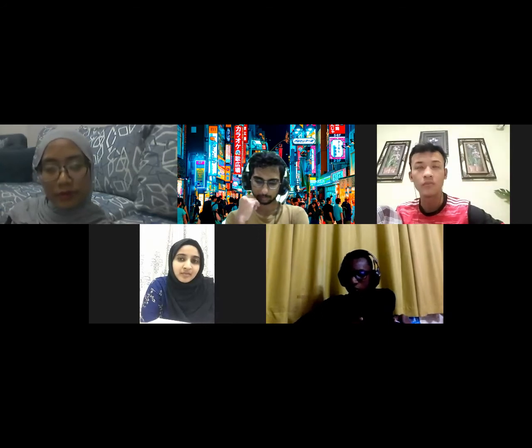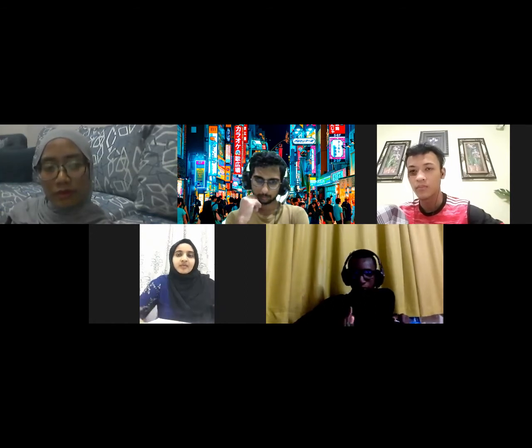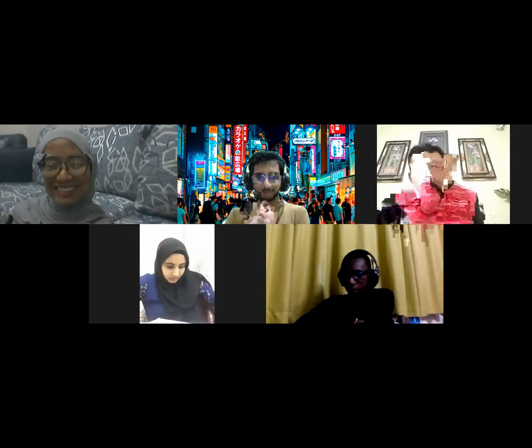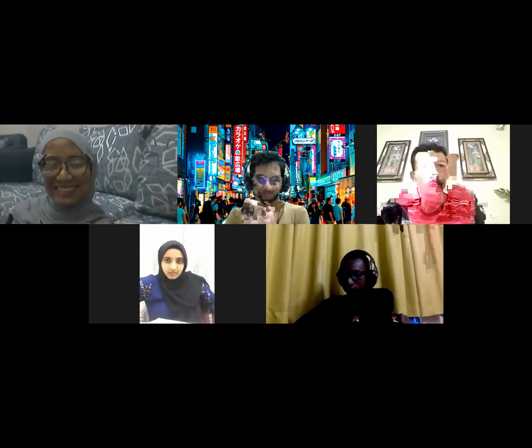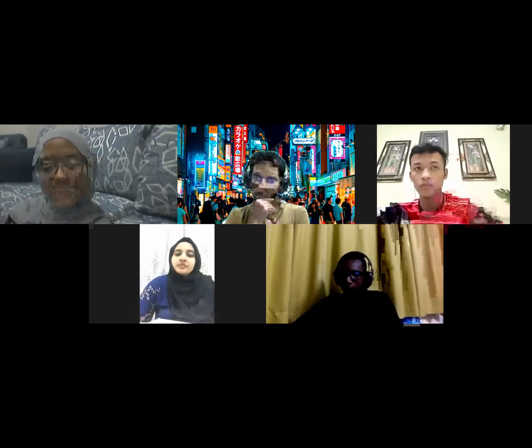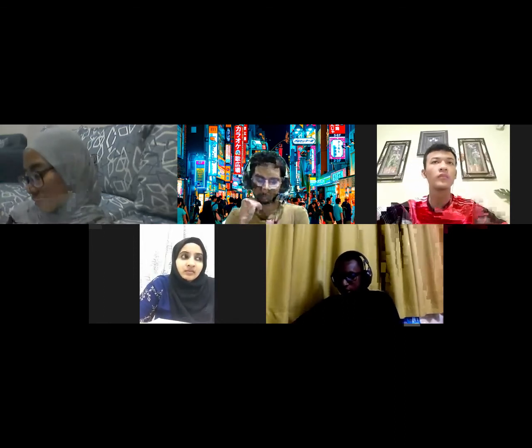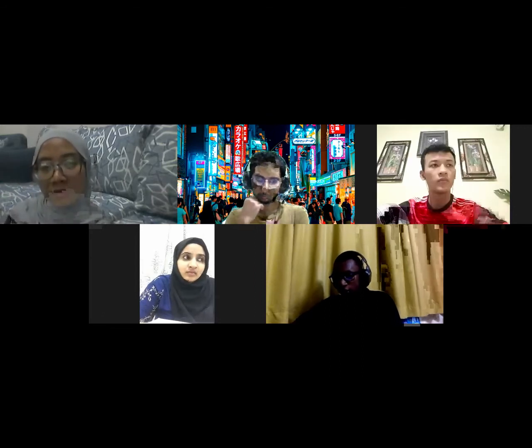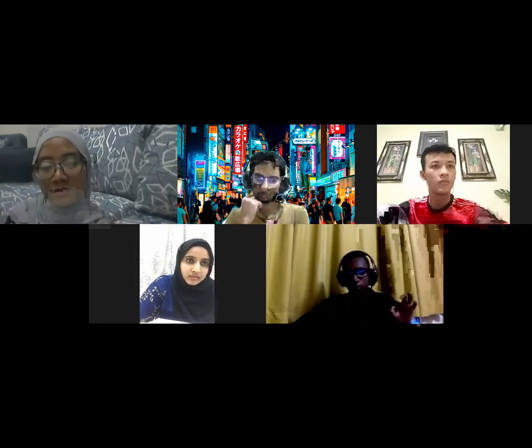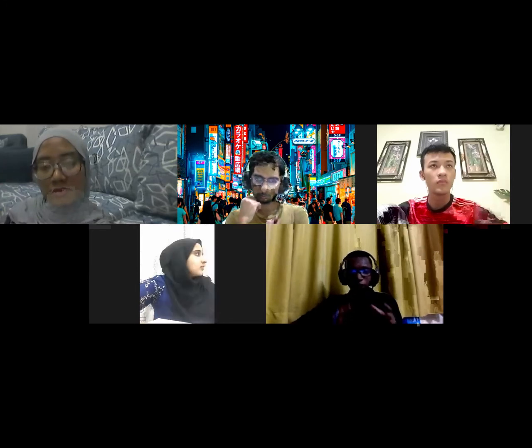I had about 10 choices actually, but I chose the best one among them, the one that had a GC content between 45 to 60% and the optimum temperature, as well as TM. For the forward primer, I got GGCGAACCAGAT, 4 A's, then TG. That was for the forward primer. The GC content was 45%. I chose it because it fell within the acceptable range.